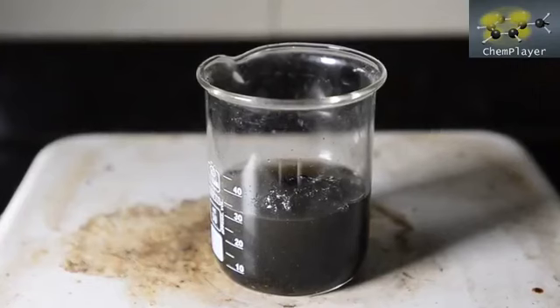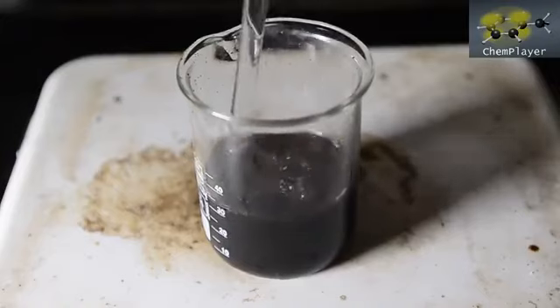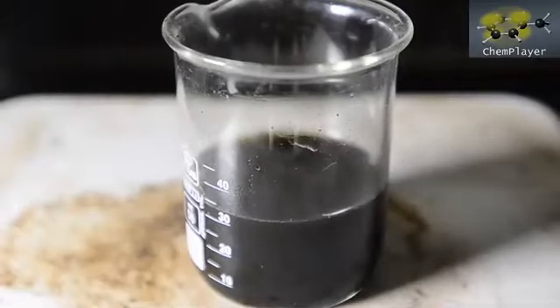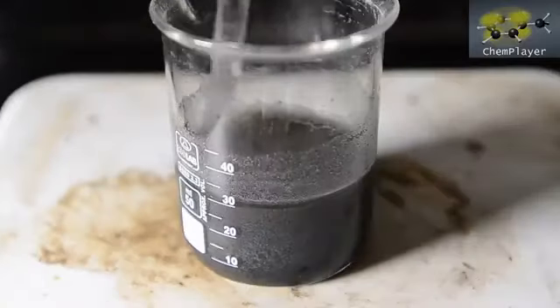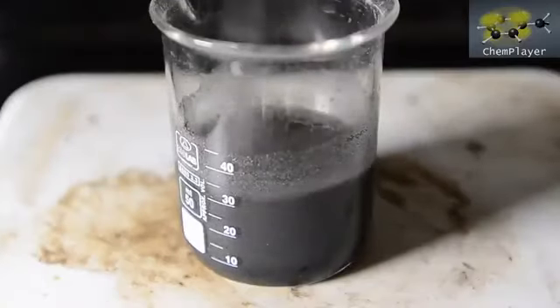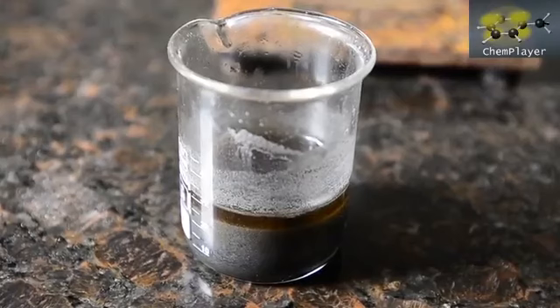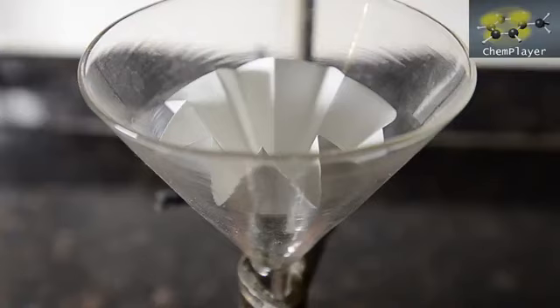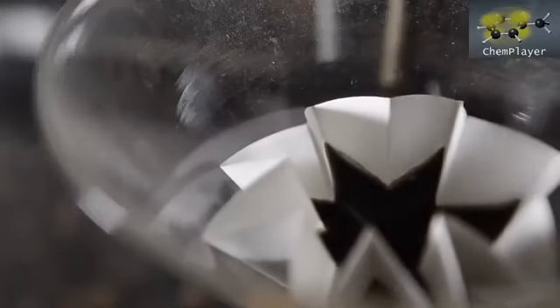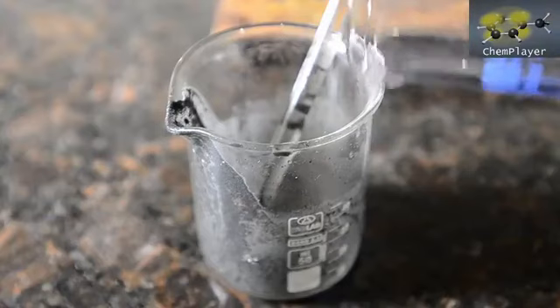We also roughly want to test the solubility of the soluble component, so let's see if we can make up a saturated solution. We've now only got a fine powder, so at this stage we'll filter the warm solution. We'll do this old school using a paper fluted filter. And we'll use another 10 ml of warm water to wash the beaker and the contents of the filter.